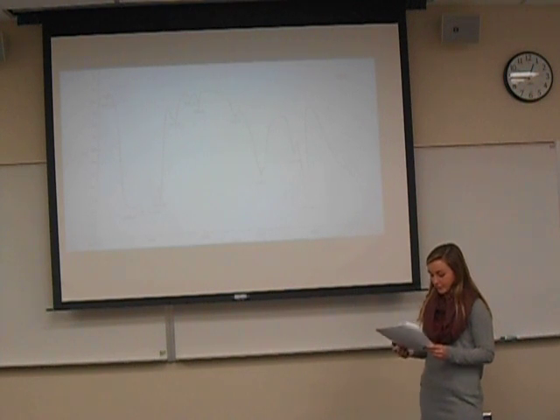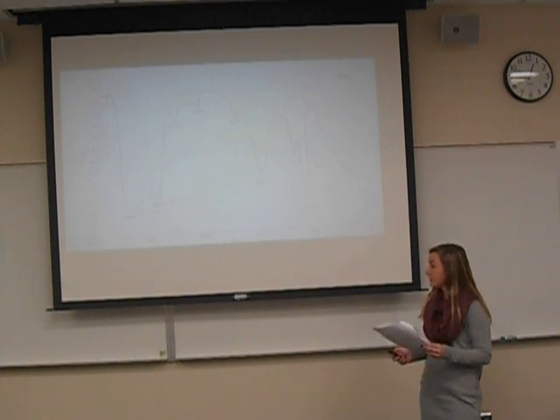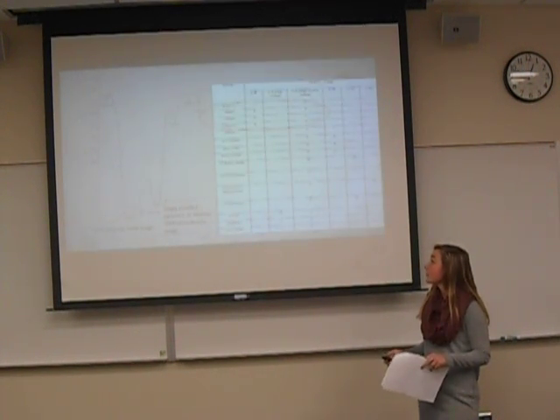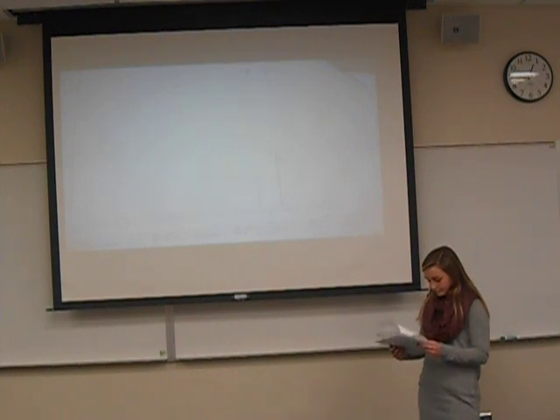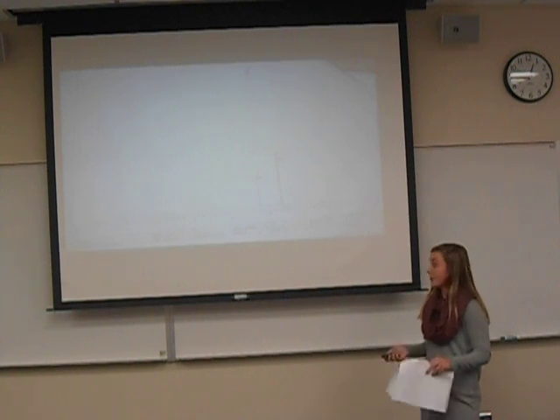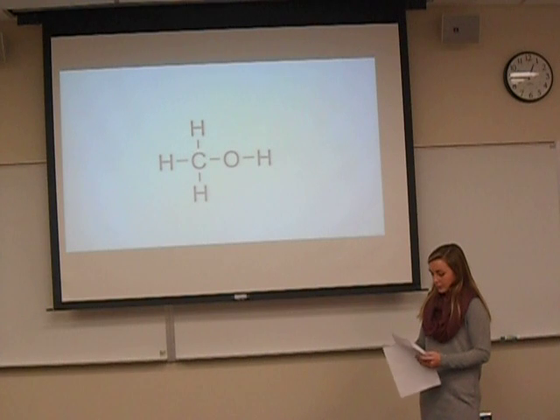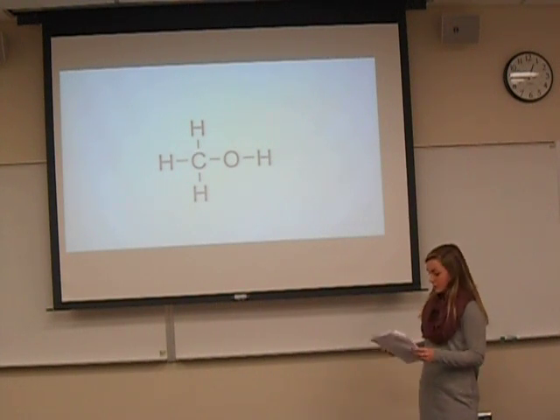The IR chart for unknown compound A shows peaks in the singly bonded CH absorbency range, as well as the OH absorbency range. Narrowing it down to these 4 options. After analyzing the NMR graph, which shows 2 peaks in the 1:3 ratio, the only possible compound was methanol. This is the methanol compound, and it shows the CH carbon functional group and the OH functional group.